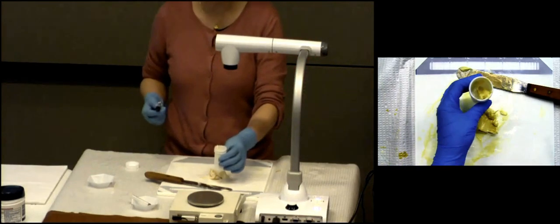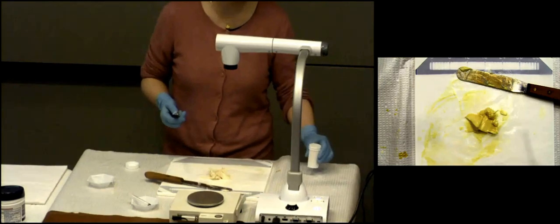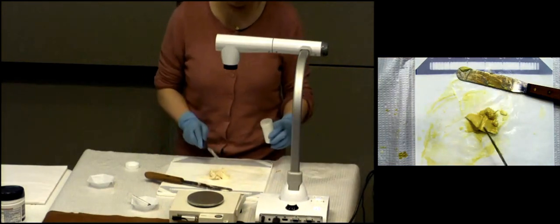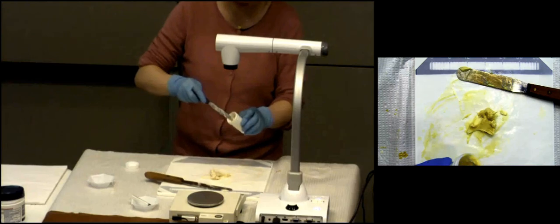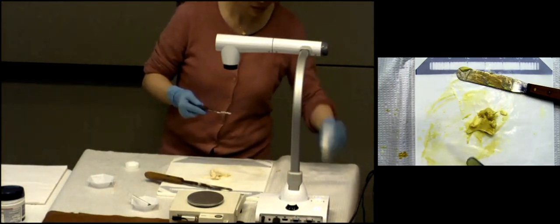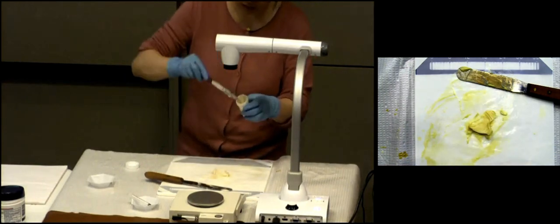But guess what? Does it really go to the bottom of the bottle automatically? It doesn't. It's pretty stiff. So what do I need to do? All right, I need to tap on the bench, and you do the same thing. Where would I remind you, where does the ointment go? The inside. So use the smaller spatula. Don't try to glob it all in there in one go. It'll stick and get everywhere. So try to put smaller chunks. Get it in the middle.